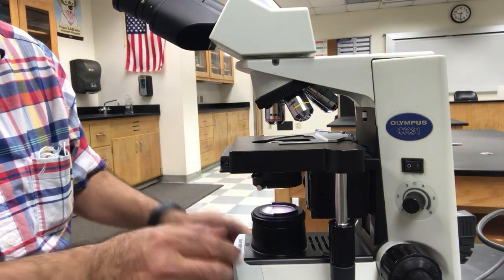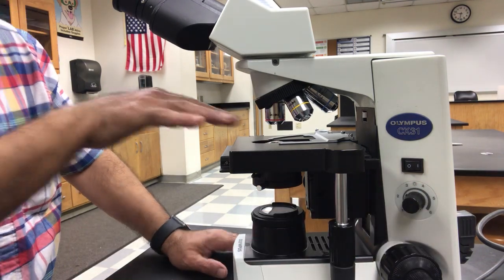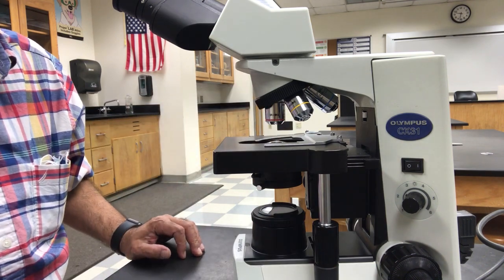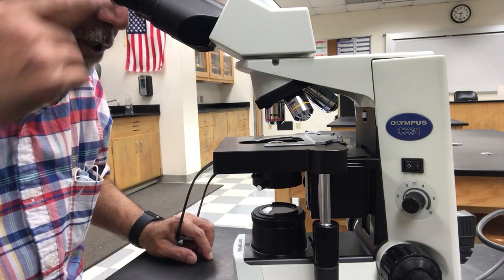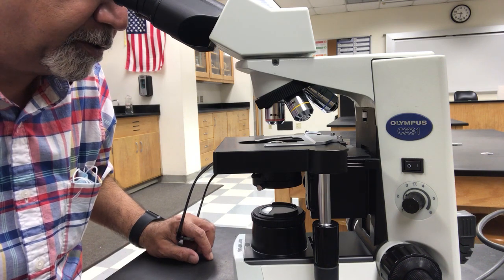So you would start with the light a little dimmer. You would put the lens here, the slide here, adjust the slide, bring it down to the middle. Put your eye here on the lenses, not letting your eyelash touch the lens, right about an inch and a half away from the ocular lens.